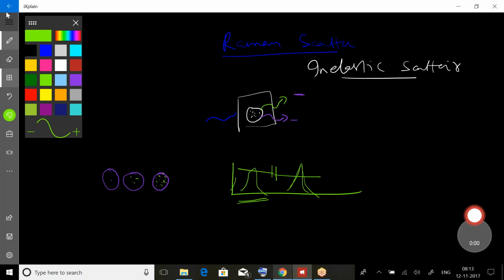That cell also gives certain fluorescence. So if this is, say for example, I'm talking about FITC here, if this is the FITC fluorescence we are collecting, this channel we are collecting the FITC fluorescence, then even the cells that do not have a single molecule of FITC will also show up on the plot with some fluorescence. So it should not be generalized that if the cell doesn't contain the fluorochrome molecule, then it should not be giving any signal. No, it will give the signal.